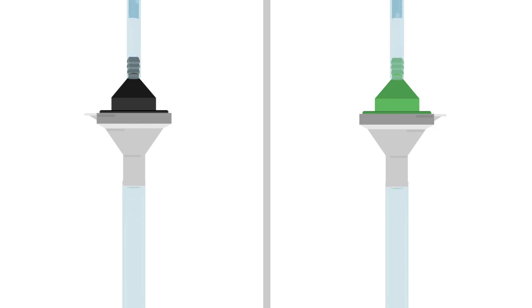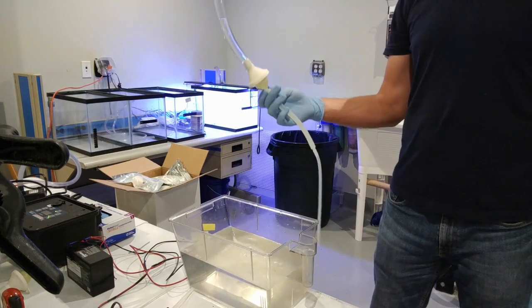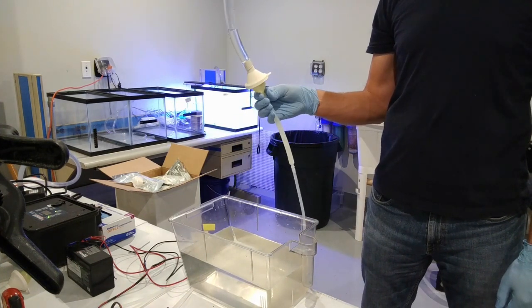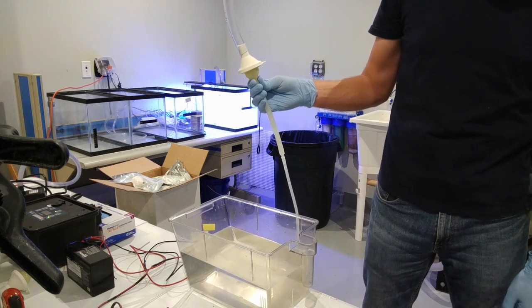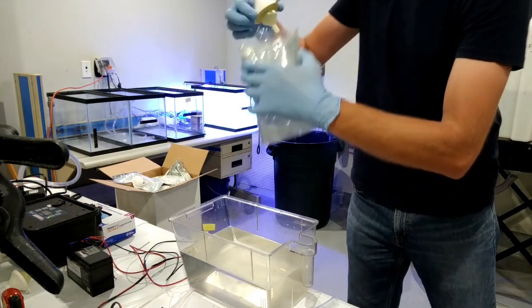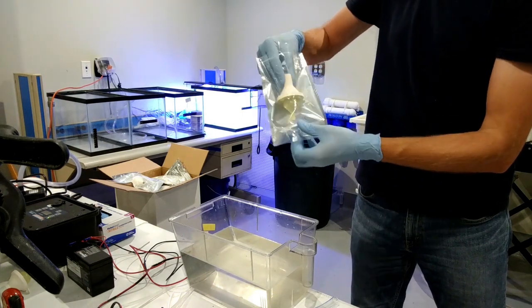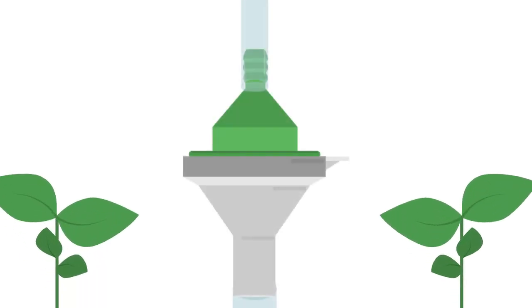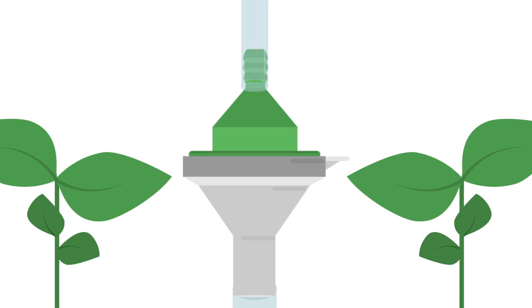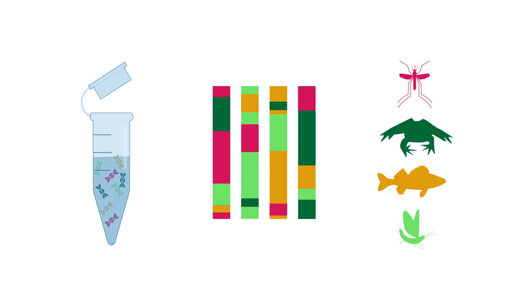Overall, the results indicate that the new eDNA collection system is a viable alternative to standard ethanol preservation methods. With an increasing number of non-experts making important scientific contributions in the field, that's crucial. Simple, easy to use, and waste-reducing, the system could be a welcome addition to any researcher's toolkit. Currently, researchers are exploring different materials options that could make the entire setup biodegradable, and ongoing field tests could reveal the benefits for other systems and for more complex applications, such as eDNA metabarcoding.